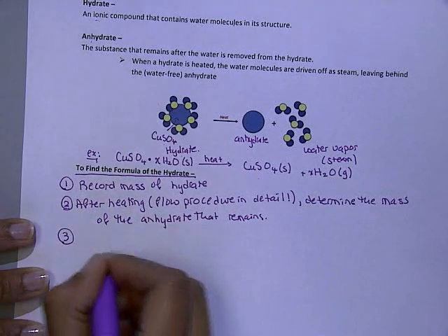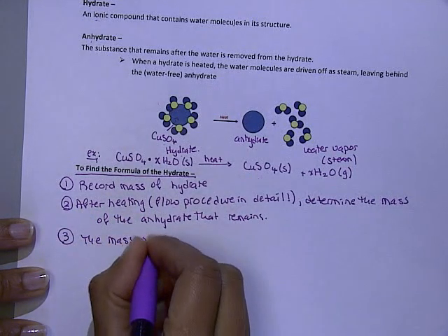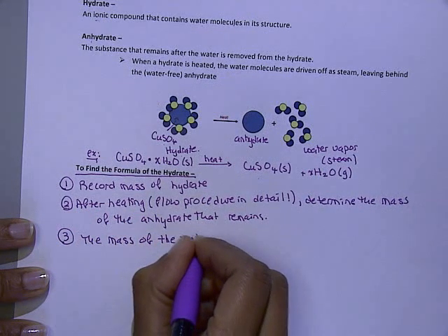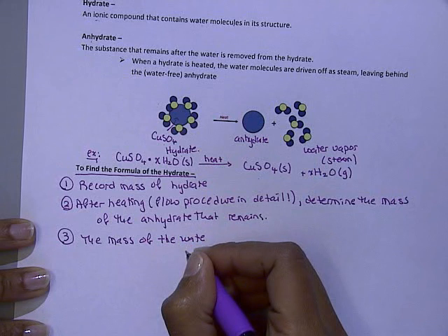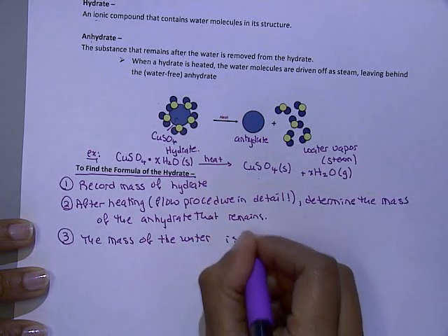The third step, the mass of the water is calculated.